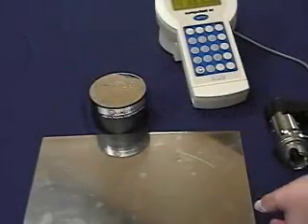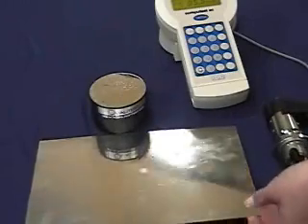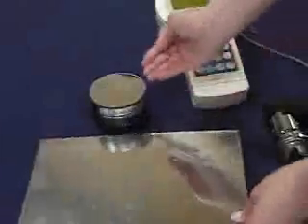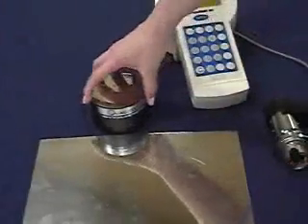The CompuTest is easy to use and very accurate. It is a portable Rockwell Metal Hardness Tester that can test very thin metals to very thick metals. The CompuTest can handle it all.